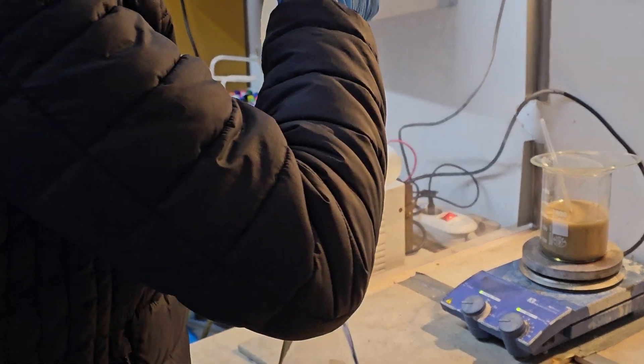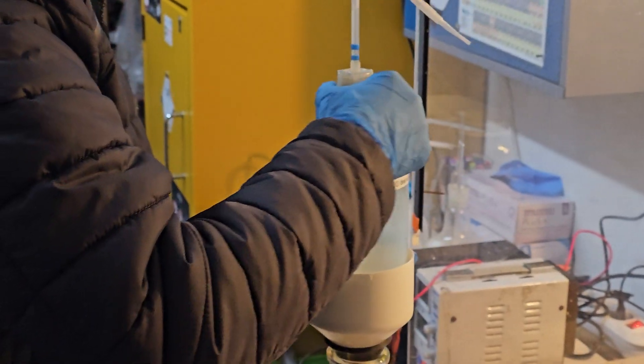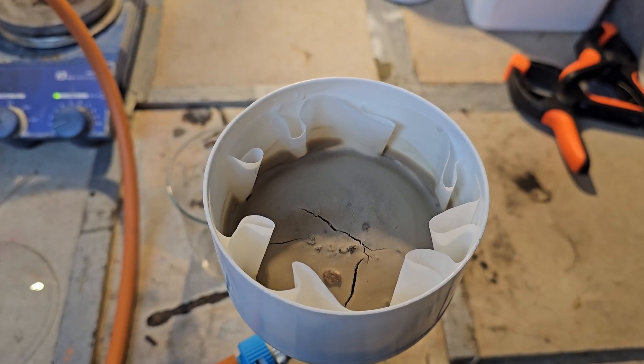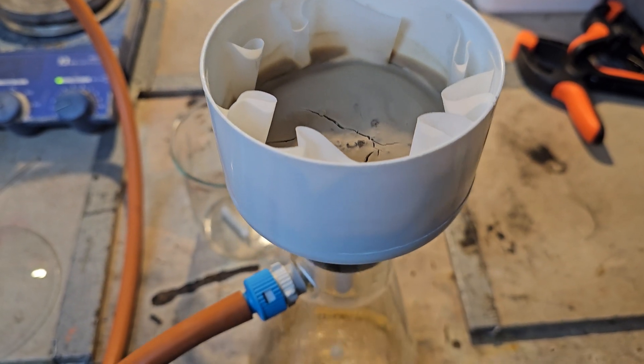Following the dissolution, we filtered out the impurities. The leftover filter cake was then reprocessed, ground up and re-dissolved in concentrated HCl, to ensure that no lead was left unextracted.